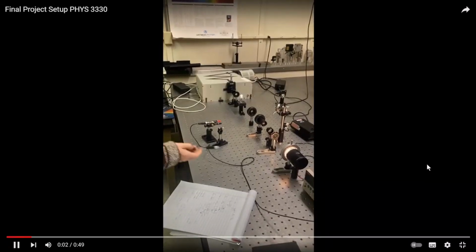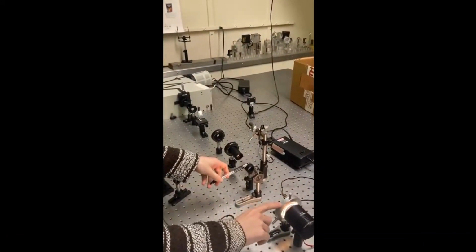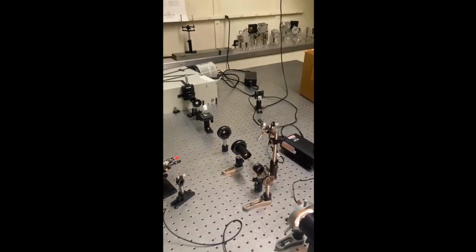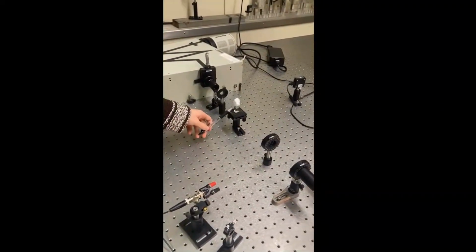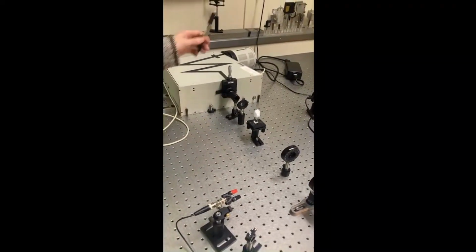So this is our setup. We have our lamp, our beam expander with our 2 lenses, an iris to help limit the light going through. We have here a linear polarizer. This is our quarter wave plate. This is our L-cysteine, another iris, our monochromator, and our CCD camera.